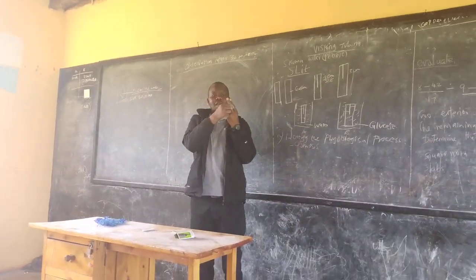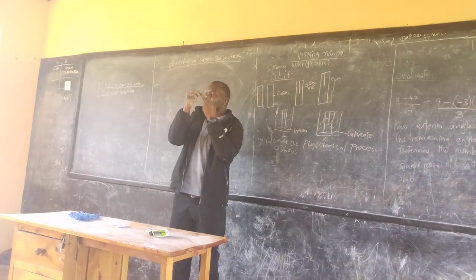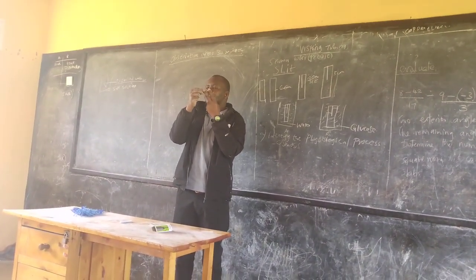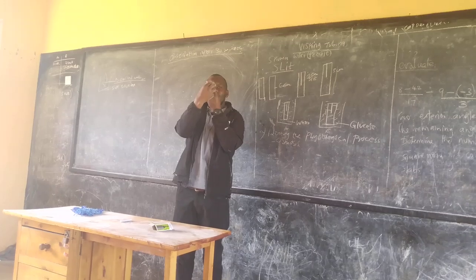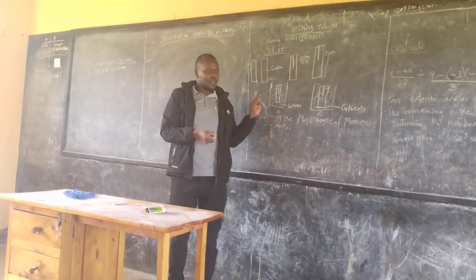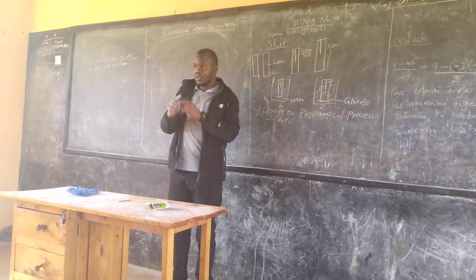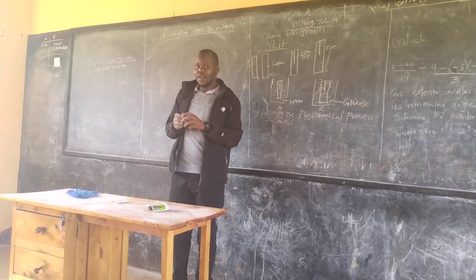So the cells are becoming turgid. Yes. Turgid. So it will go on extending. If it is losing water, each cell will be losing water as it's closing. Is that clear? So we are saying this one will do what? And you are told you do what? You draw. They were drawing after the experiment.